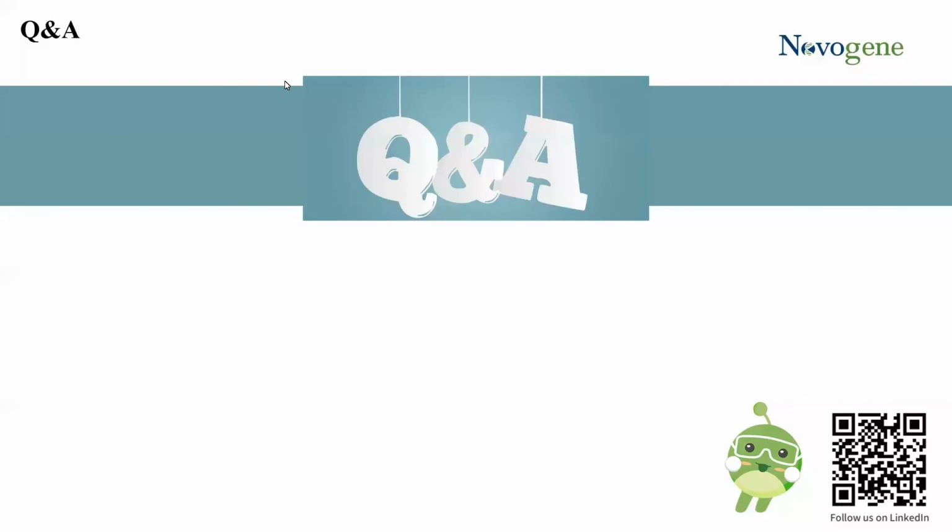As you have seen, one of our slides says we recommend submitting greater than or equal to 5 million cells for successful RNA extraction. But again, if you cannot get that number of cells, please do reach out to us. We will get in touch with our labs to see if we can accommodate the sample extraction or not. And it's case by case. But our standard recommendation for submitting cells is greater than or equal to 5 million cells.